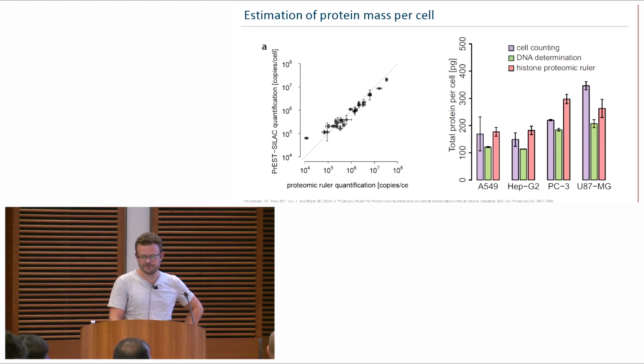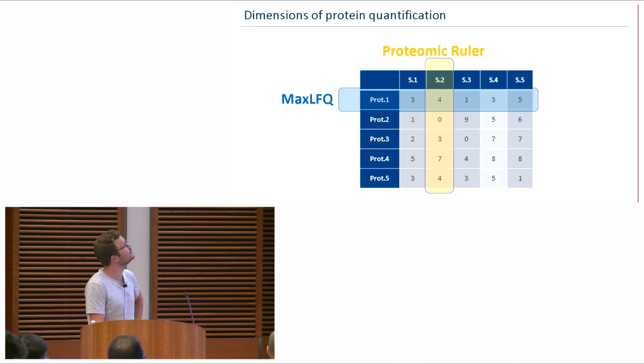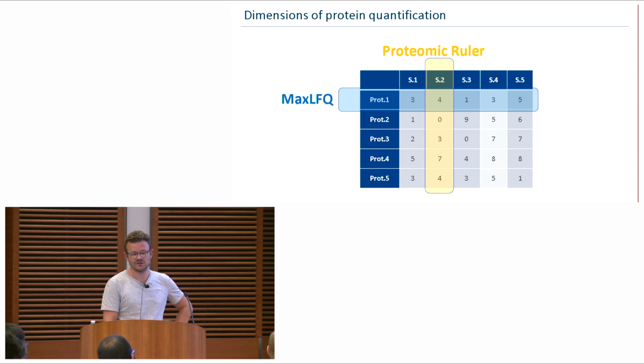Okay, so now we discovered the dimensions of protein quantification: relative quantification using the MaxLFQ and absolute quantification with the proteomic ruler.